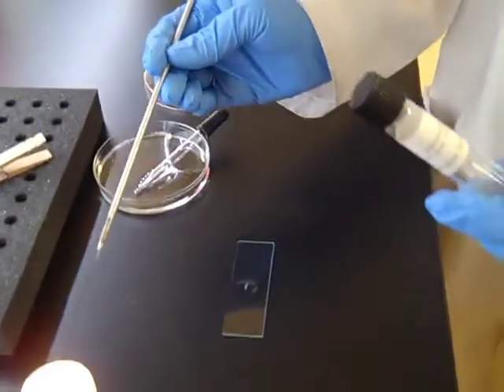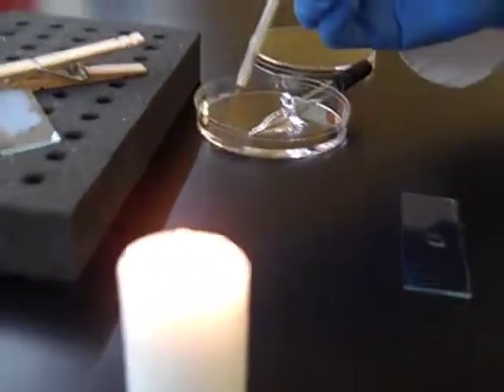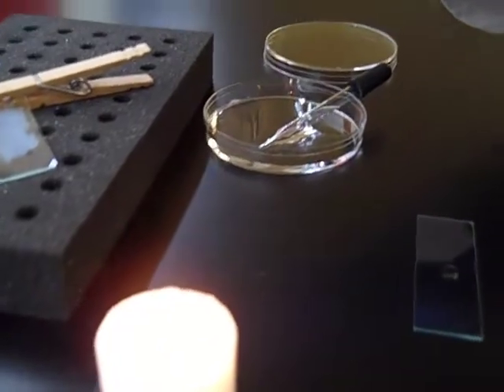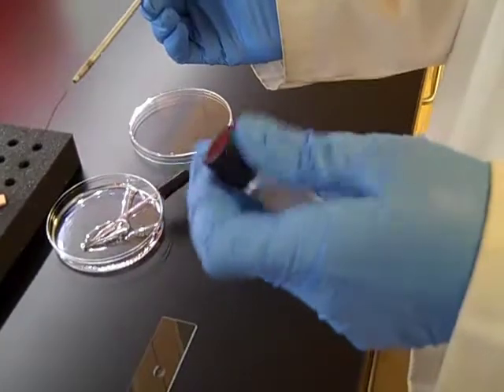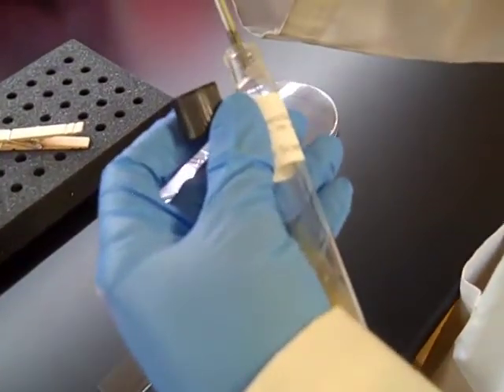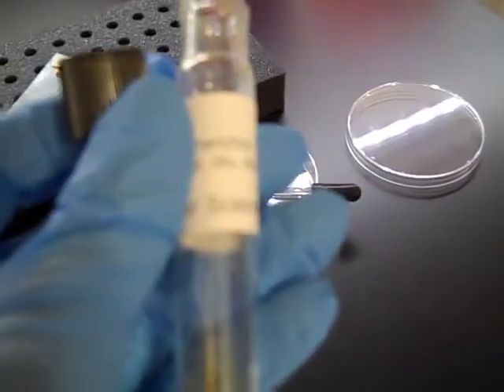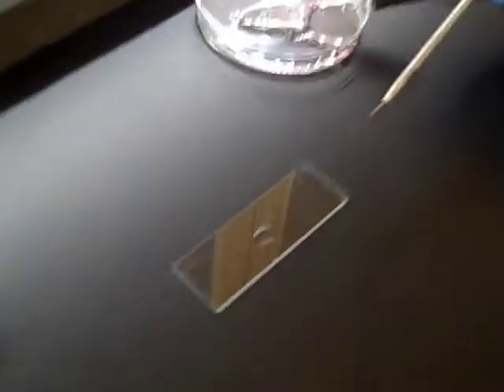Next, you're going to aseptically transfer some of the bacterial culture from your slant onto the water drop. We're going to be using E. coli for this demonstration. Just add the loop straight to the water droplet and begin to spread out. You want to spread your bacterial smear to make it even.